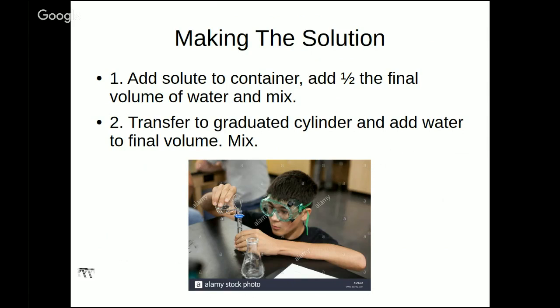Now why did I do it this way? Well, instinctively, students want to take the dry solute, the salt, and they want to add the final volume of water to it. And that's a mistake. So picture this. Had I put my salt into this flask here, and I added to it 200 mL of water, because I want to make 200 mL of solution, if I'd done that, I would end up with too much solution, and it would be too dilute. I added too much water. You have to take the volume of the dry solute into account when you do this kind of solution preparation. Or you'll end up with too much solution. So very simply, don't worry about calculating the amount of water you need. Just put it into the graduated cylinder, add water until you get to the final volume, and then mix it one more time. And you're done.